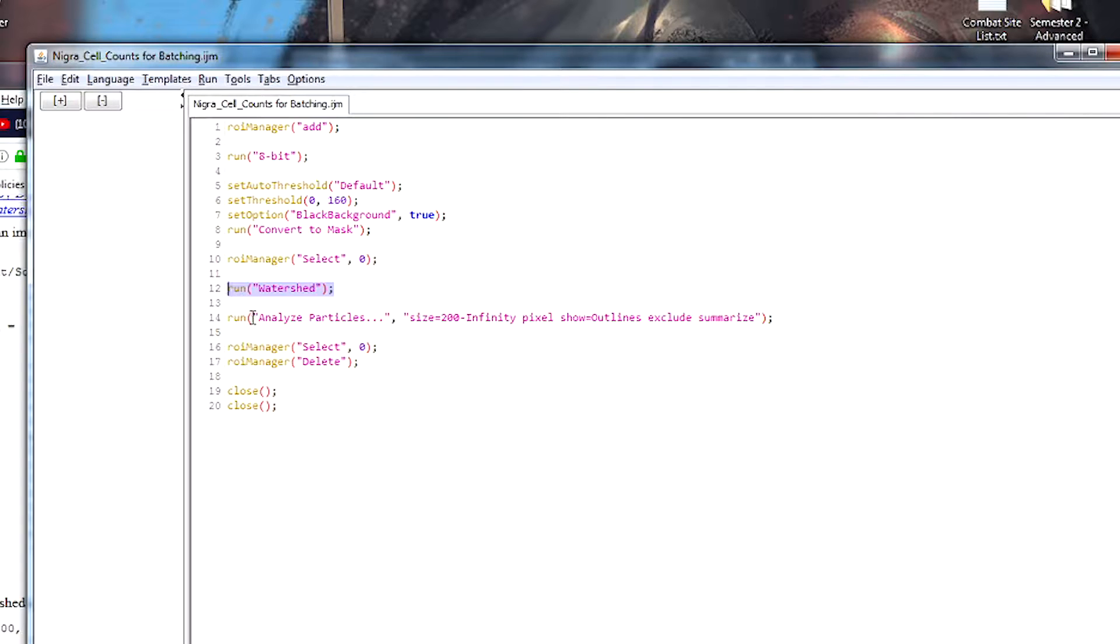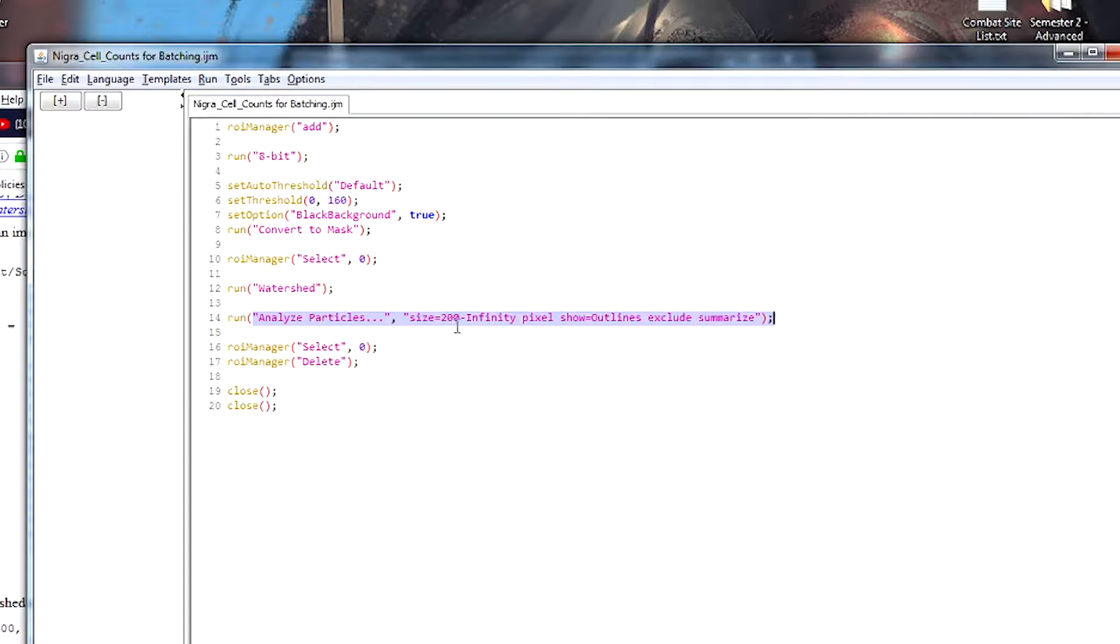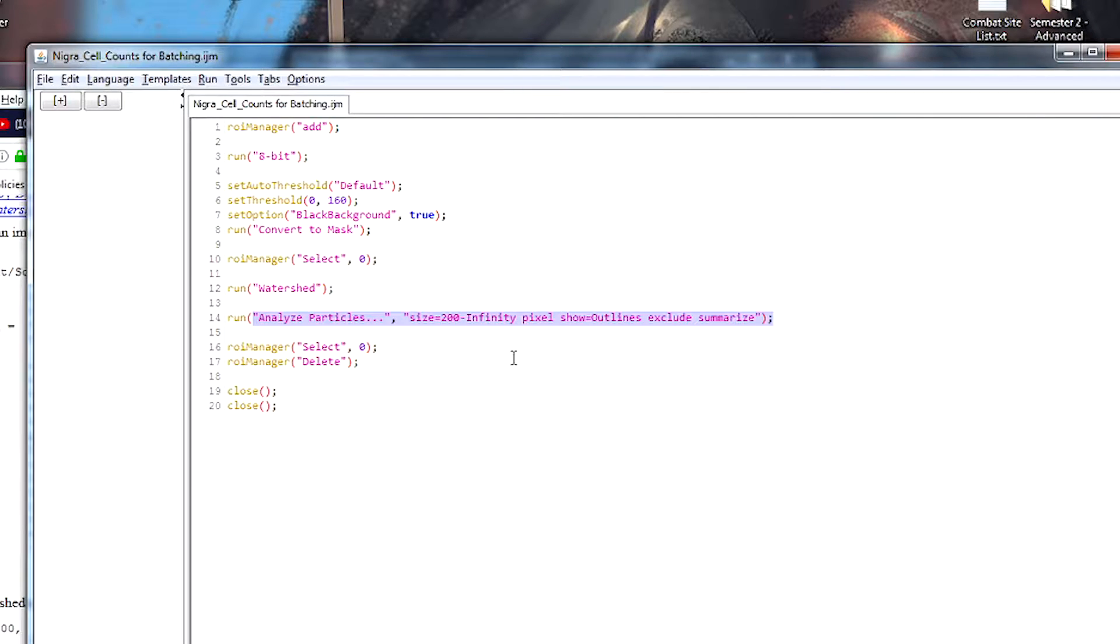We use the function called analyze particles and we're telling it to count everything that's above 200 pixels. So there's obviously going to be things that are smaller than 200 pixels, but we're saying that they're probably not cells. And again, that's very much a compromise thing.